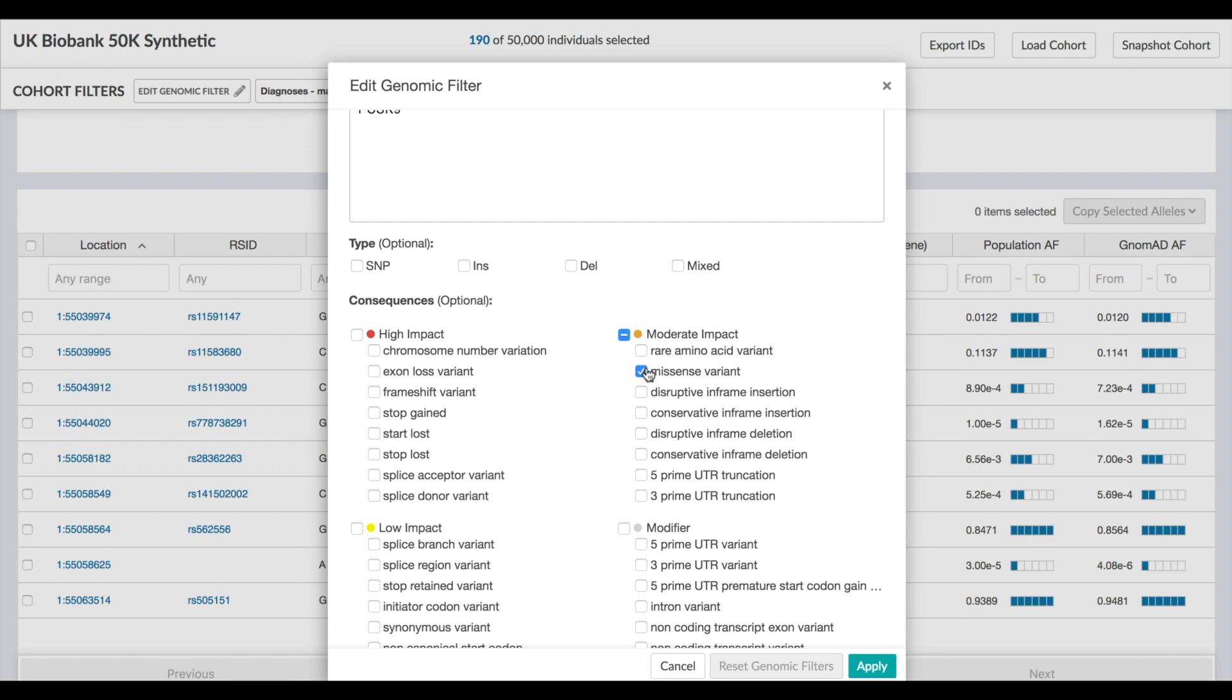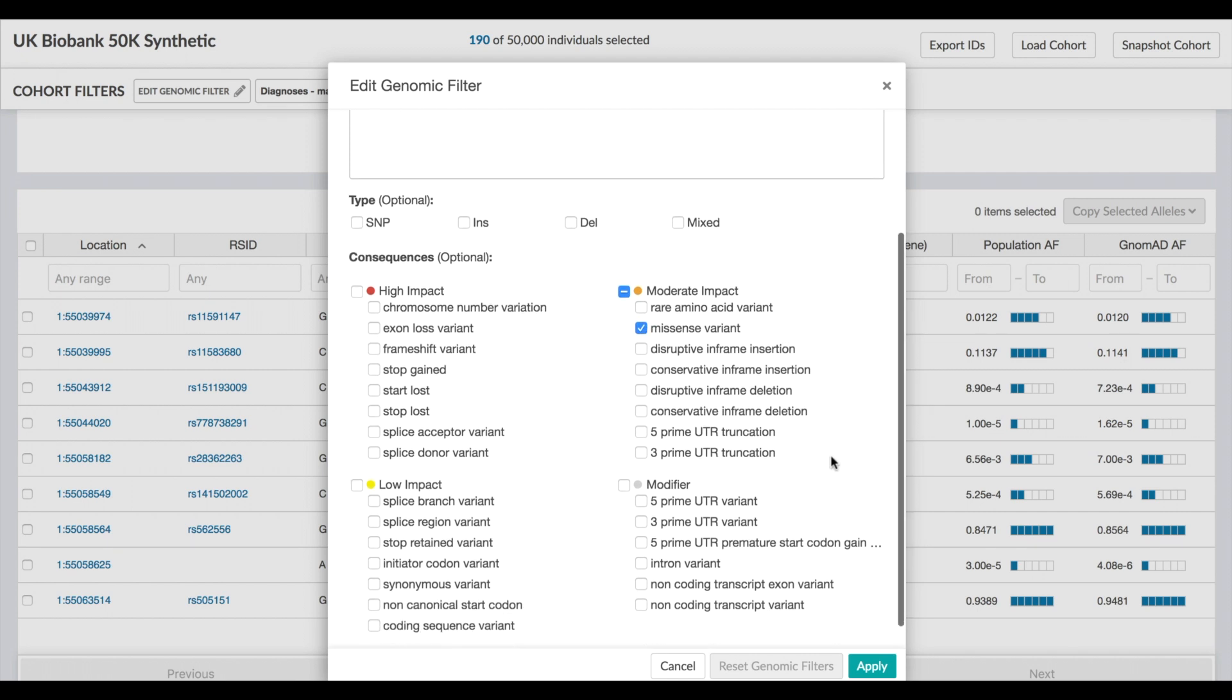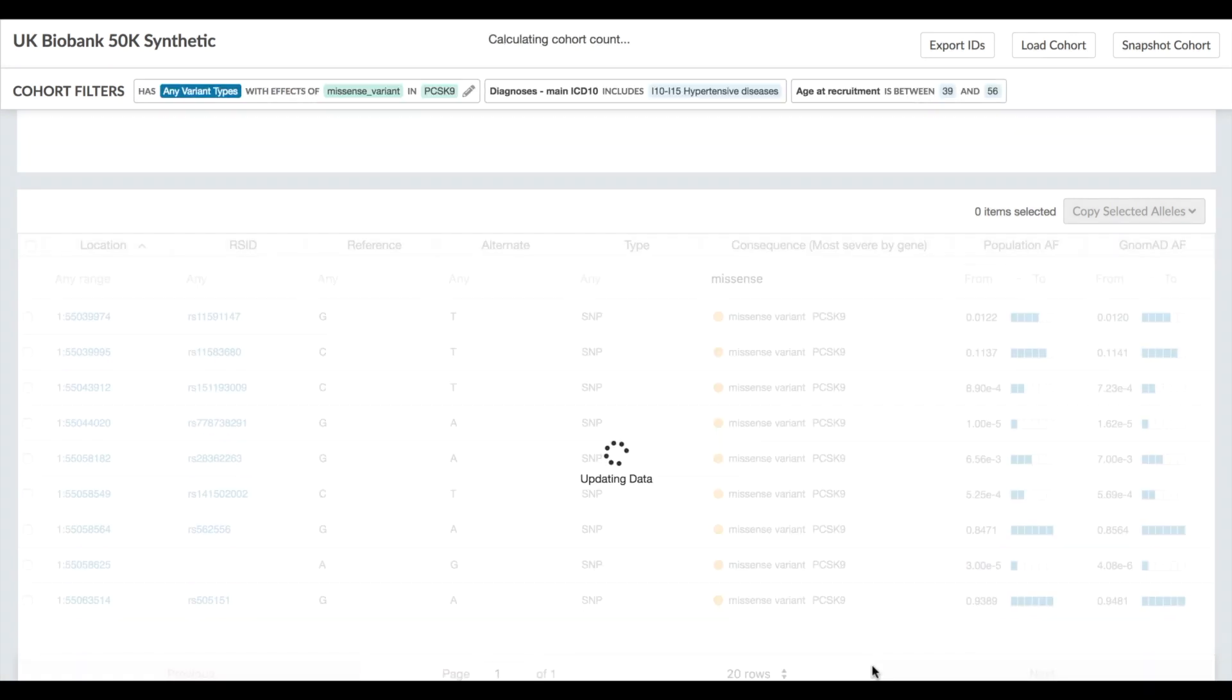These genomic criteria apply on top of the phenotypic filters you have in place, providing an extremely flexible and integrated way to explore this complex dataset.